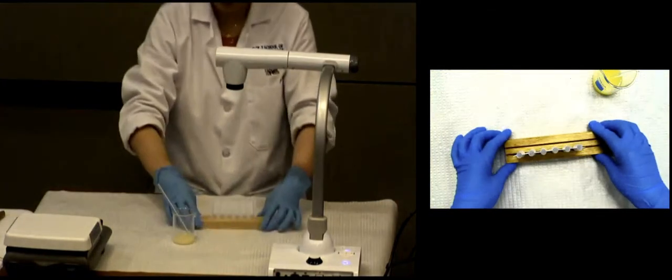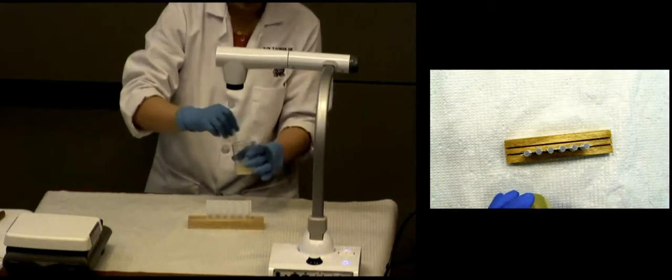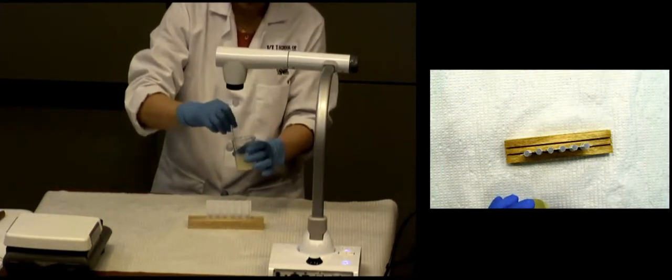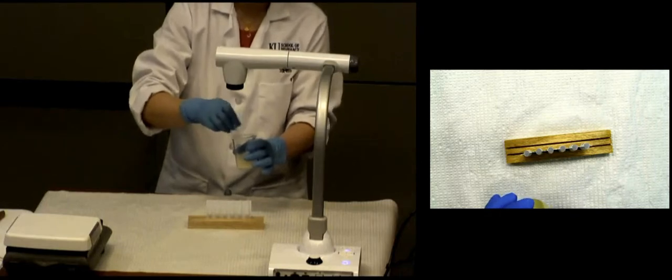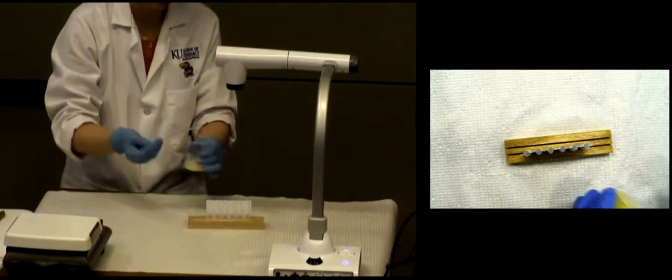So remember we prepared our plastic mold at the very beginning. Okay, I'm ready to pour now. So before I pour, I want to give it a very good stir. Okay, I want to make sure that my drug particles are evenly distributed.